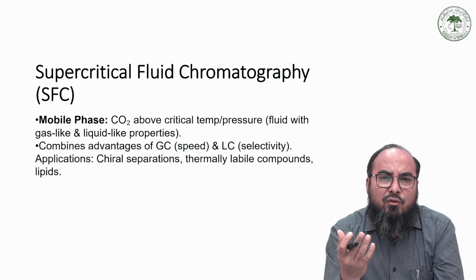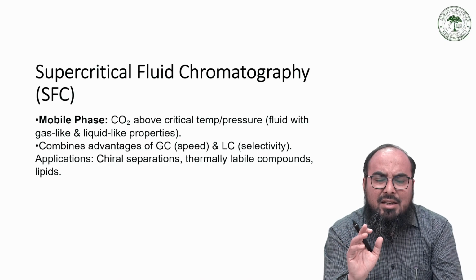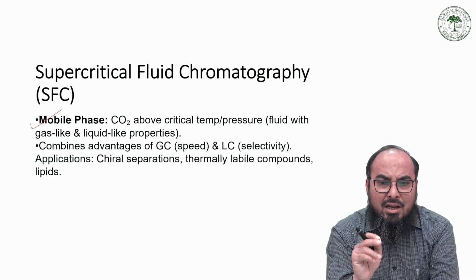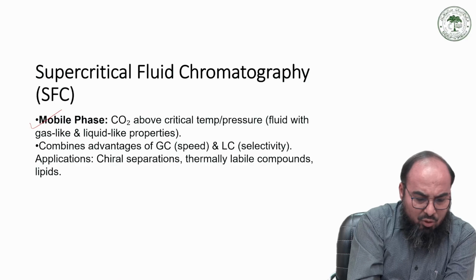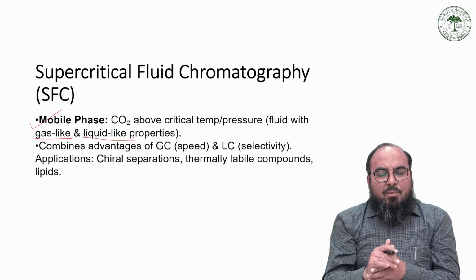Now the supercritical fluid chromatography. This is a very specific technique, not commonly used, but again it has very specific applications. Here we take carbon dioxide as the supercritical substance, and above its supercritical point, the beauty is that it acts gas-like, and it also has some liquid-like properties.